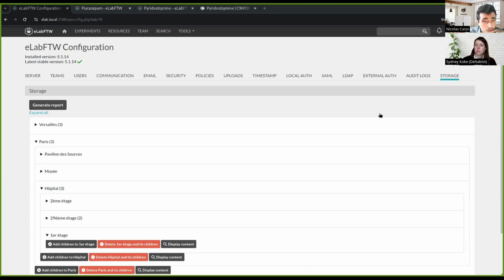And a default consumable quantity. Yeah, okay. Gerhard Eisenberger: we always need the SDS file, the safety data sheet, for every chemical we use. Can the chemical tool automatically import the needed SDS file to the chemical resource?